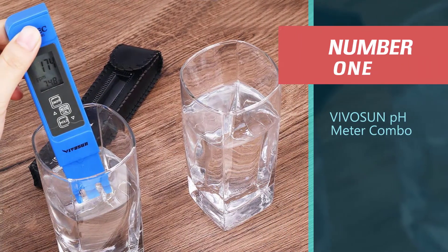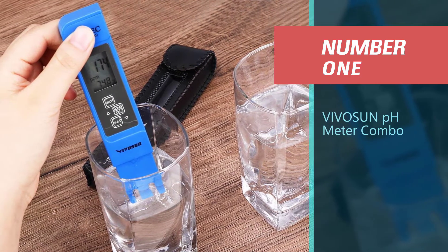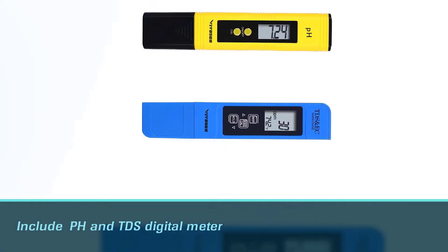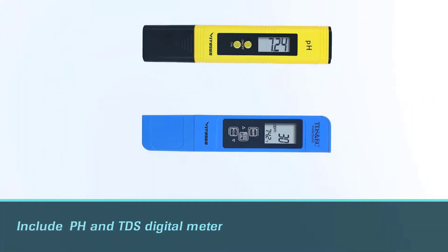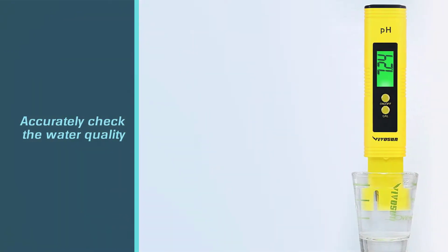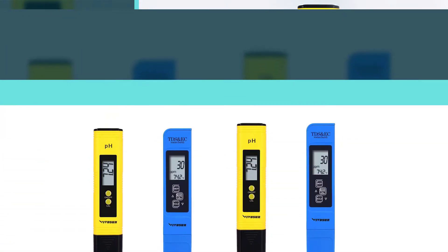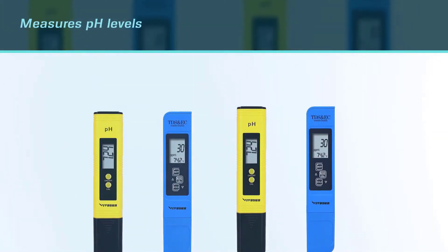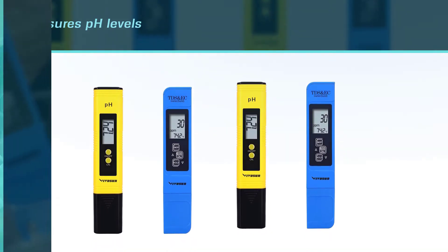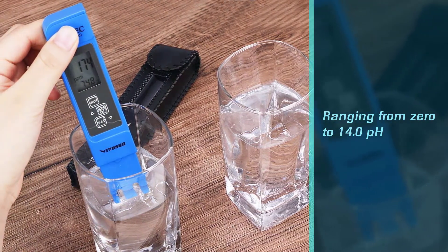Number one, most popular: VIVOSUN pH Meter Combo. As the name suggests, the VIVOSUN pH meter includes pH and TDS digital meters to accurately check the water quality of the hydroponic garden. The pH meter measures pH levels ranging from 0 to 14.0 with an accuracy of 0.05 pH and a resolution of 0.01. It comes with a battery button, a power button, and an automatic calibration button.